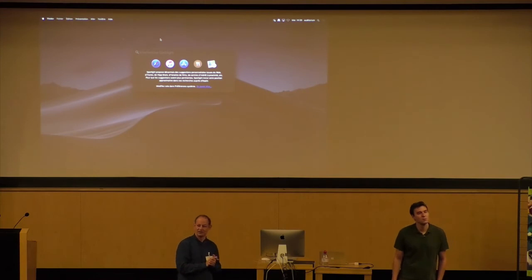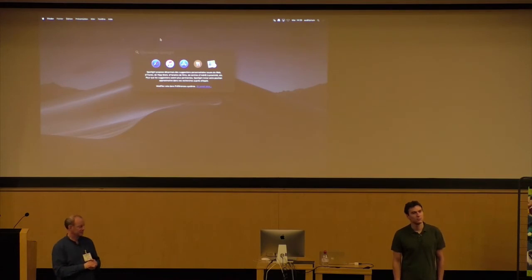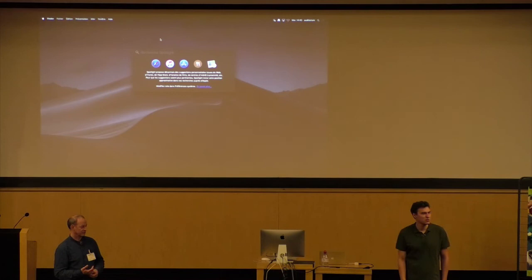There's one more question there. You were talking about an ice distribution around the grid. Do you also see an ice distribution inside one square or inside different squares, or is it different ice on the grid? Exactly, different. Yeah, you have a gradient. As I said, normally in the middle it is too thick, and on the outer rim it's much too thin, and in between you have a gradient. Yeah, this is on a grid level, but what I'm talking about is more within one square. Yes. So when you do the GP2 or Vitrobot, then you mostly see a difference on square level. Or close to the bars, sometimes it is thicker, but it's not super close to the bar, that you see it usually everywhere. Okay, good. Thanks.